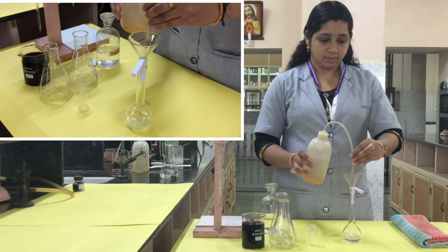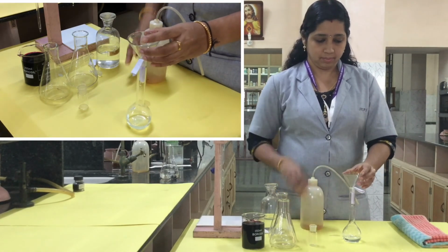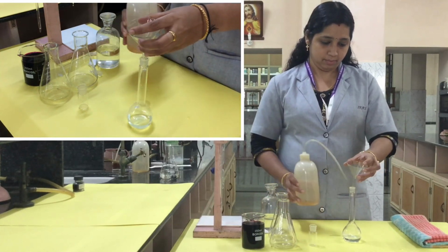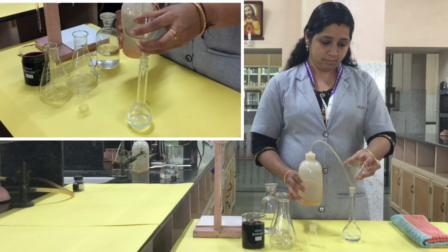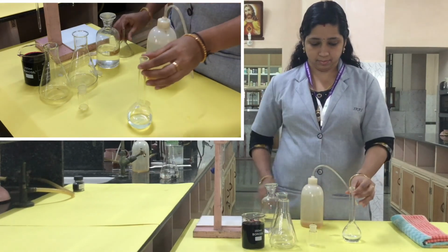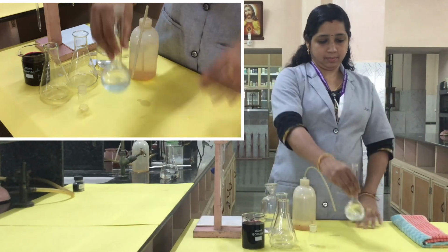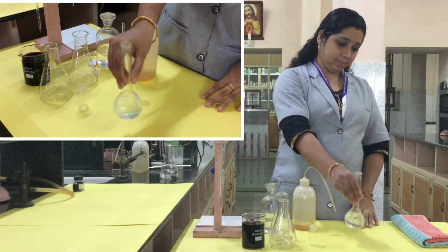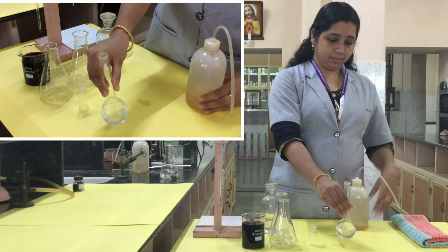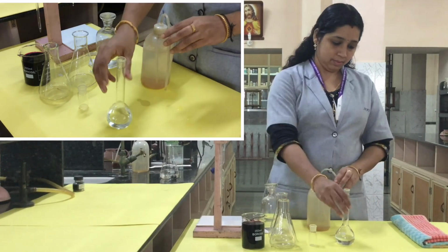Then again add water. Just wash this funnel, and the stem of the funnel also you want to wash thoroughly with water. The sides of the standard flask, just wash. Just swirl the standard flask after adding water, to dissolve the contents, to dissolve this Mohr salt. The standard flask contains this water as well as H2SO4.